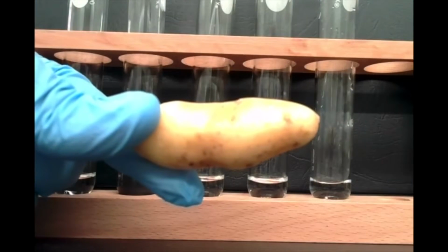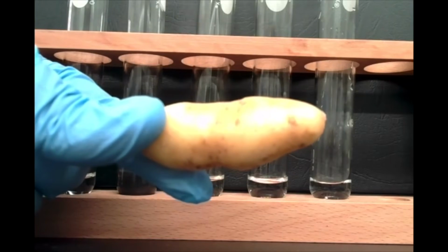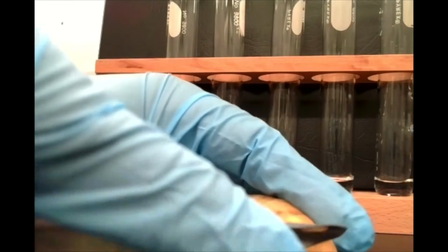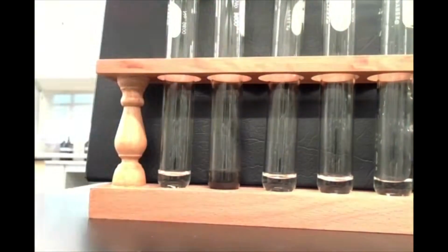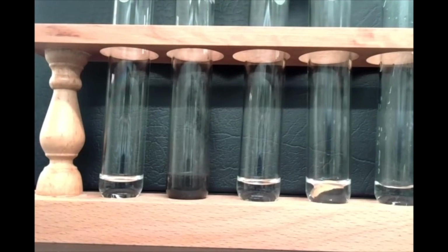Here is a potato. I'm going to cut out a chunk of this potato and add it to test tube number 4. So I'll just use a spatula here. That should probably be sufficient to get the job done. If you want to see that there, just take out a little chunk of that. There we go. So we'll go ahead and add that to test tube number 4.